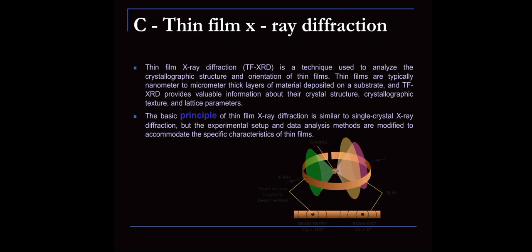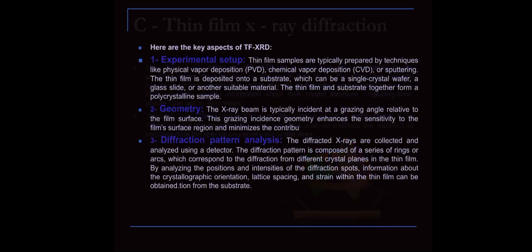The basic principle of thin film X-ray diffraction is similar to single crystal X-ray diffraction, but the experimental setup and data analysis methods are modified to accommodate the specific characteristics of thin films. This is a diagram of thin film X-ray diffraction.